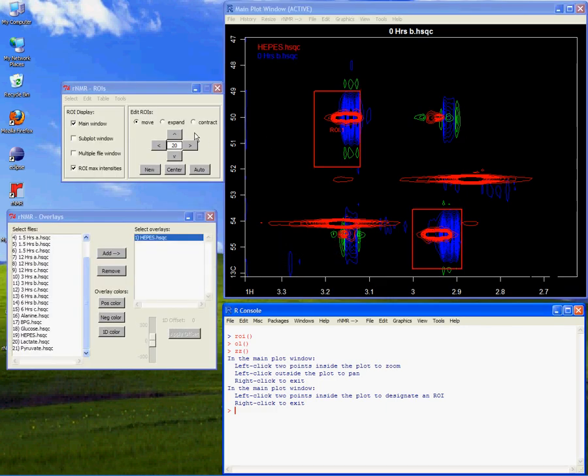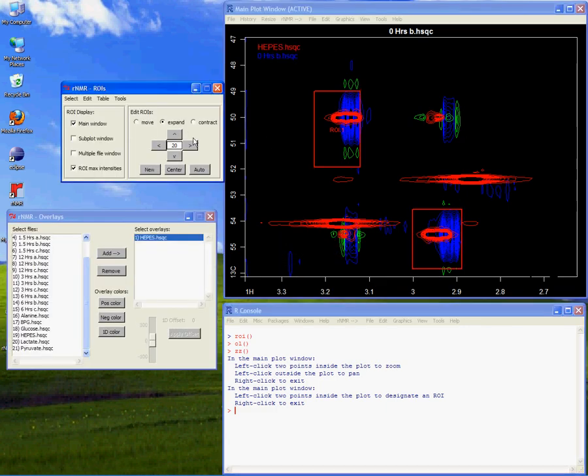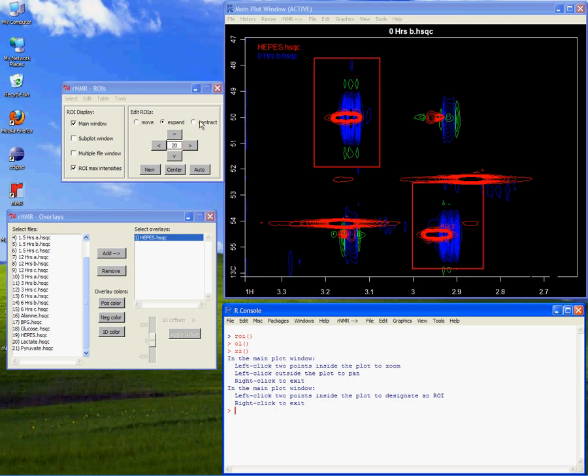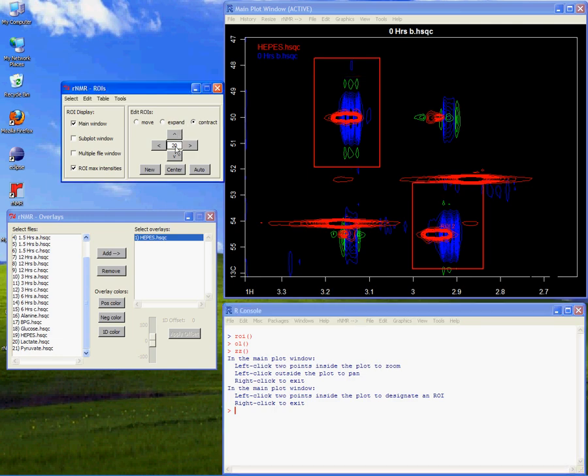Because ROIs are defined only by chemical shift ranges, they can be easily moved or resized. Once defined, ROIs can be viewed in multiple spectra simultaneously using the multiple file window.